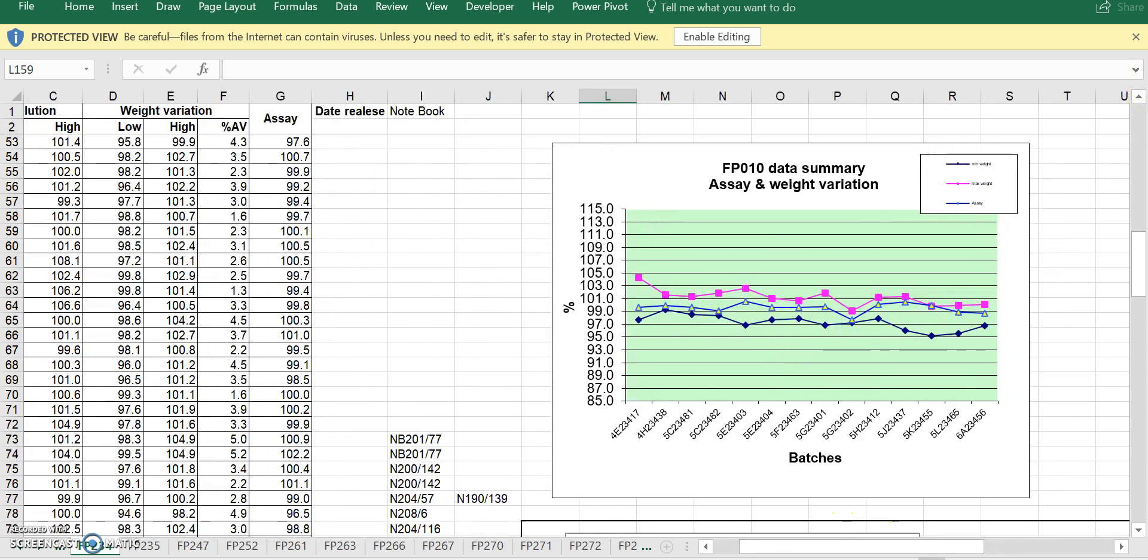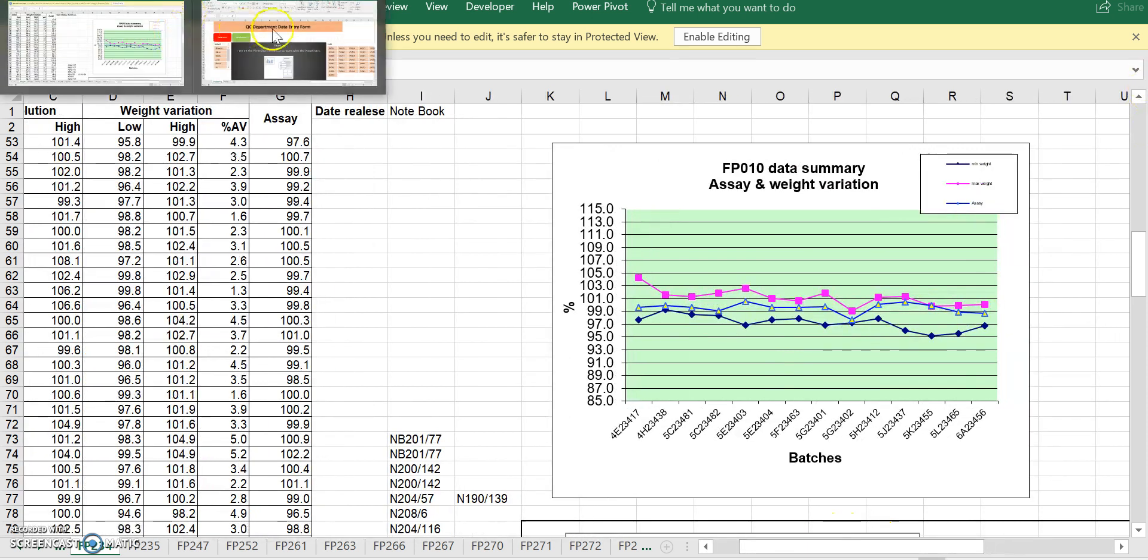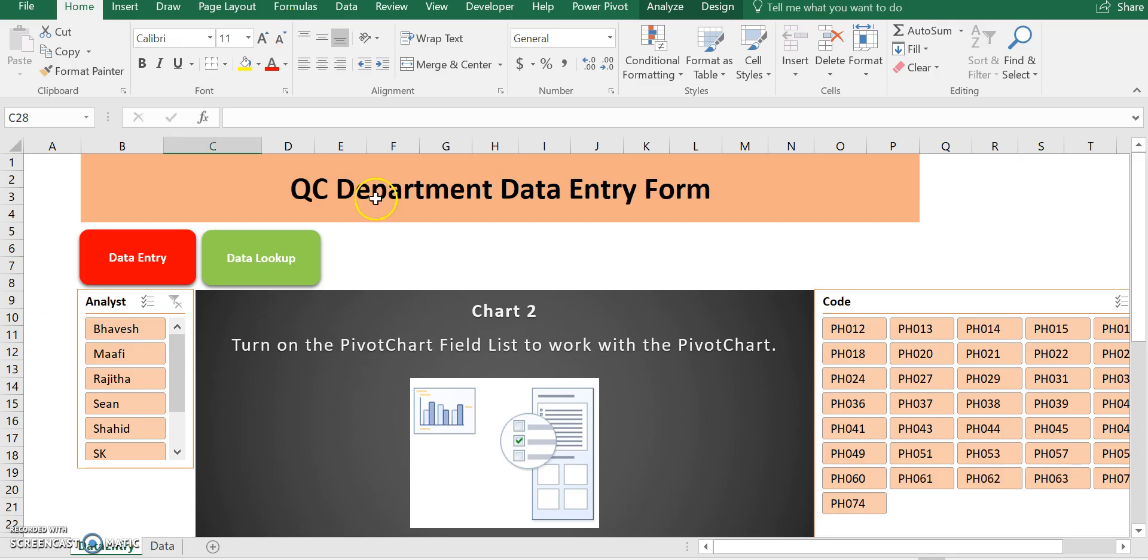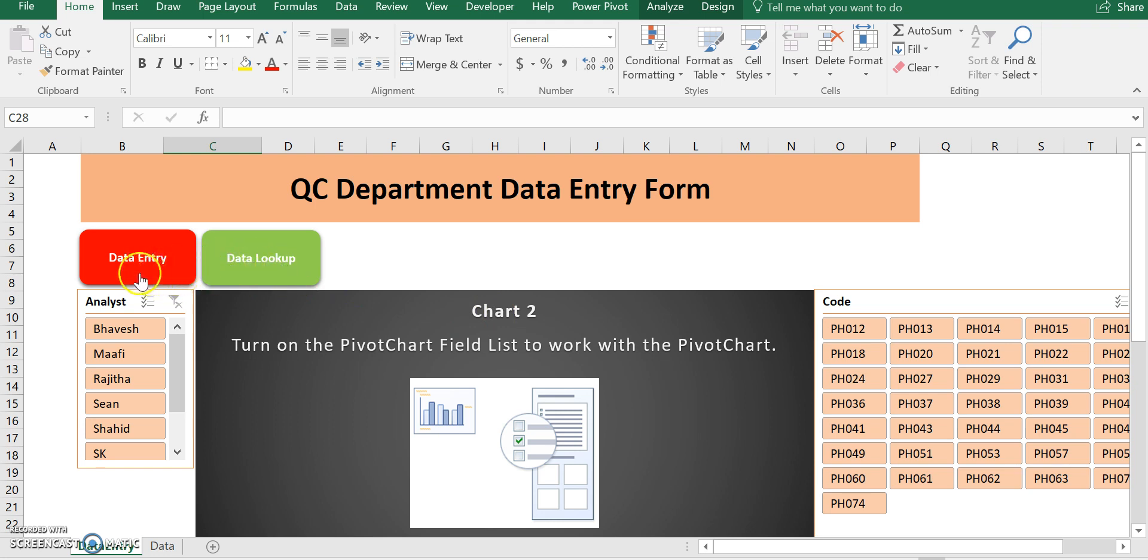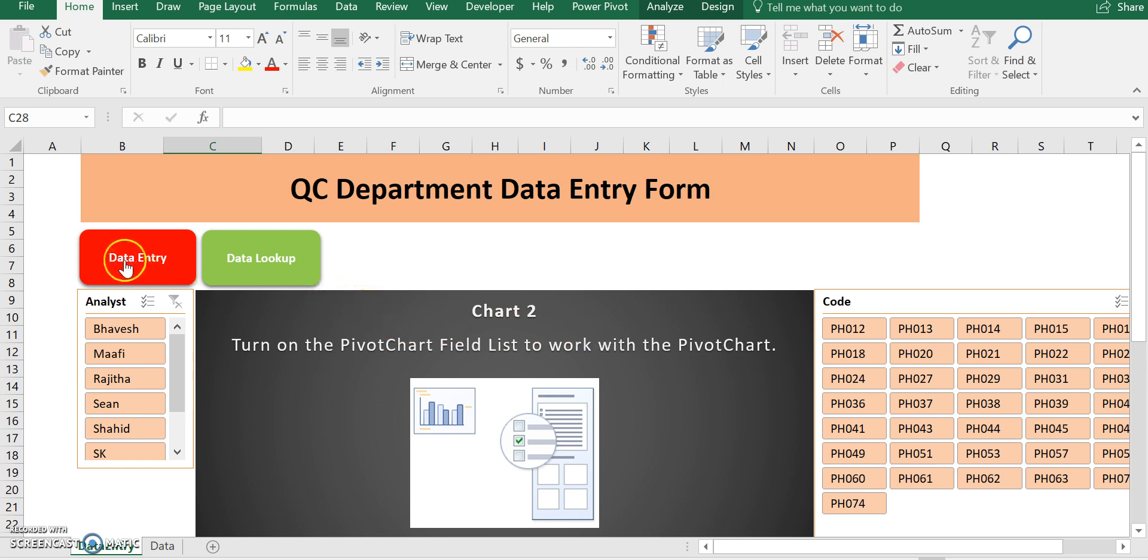Now, going back to my user form that I created. So this is the user form that I created for the QC department data entry form. As you can see in this, we can do two things here. We can either do data entry and data lookup, which is data search. In addition, I also integrated pivot table and pivot chart in this form. So we can actually hit a button and it will generate an SQC chart. So we don't have to be constantly updating our SQC charts.